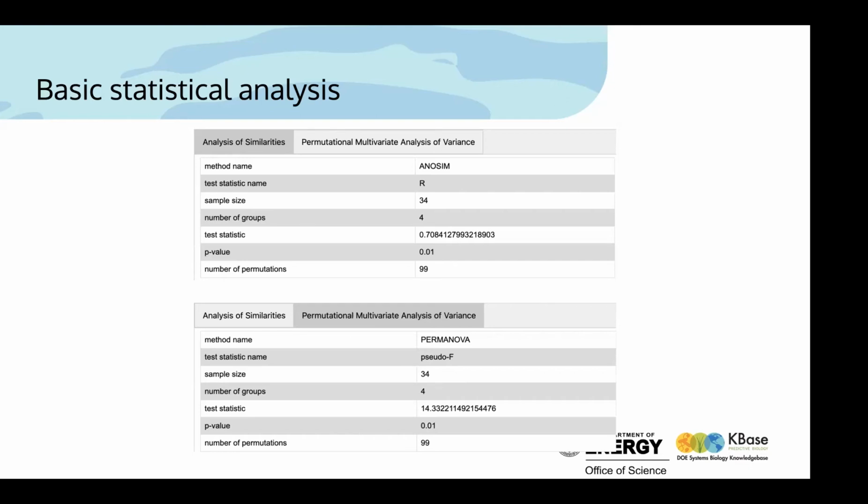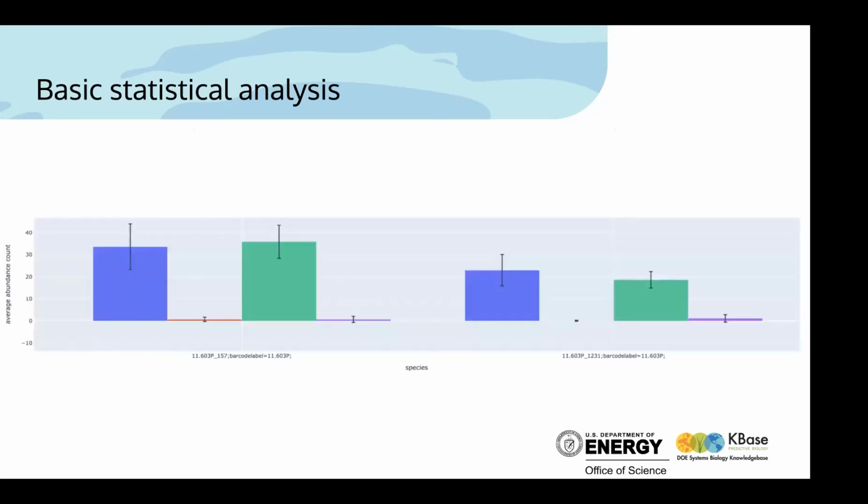So that's both the wetland and the plant species. So that's why there's 4 groups here. We'll see that in both cases, we get a good test statistic and a good p-value. So these are significantly different. Even if the test statistic on the ANOSIM says there's some overlap, that's likely due to those plant species showing the overlap in the previous image.